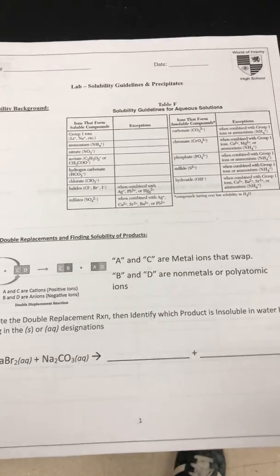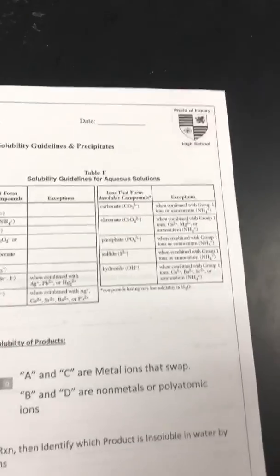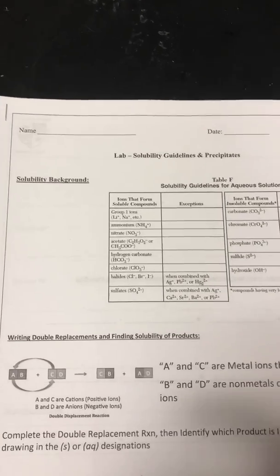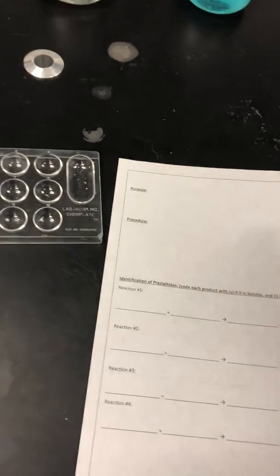Solubility Guidelines and Precipitates Lab. I just call this Precipitates Lab. So we're going to use Table F. That's our background. It's all set up for you. Isn't that nice?